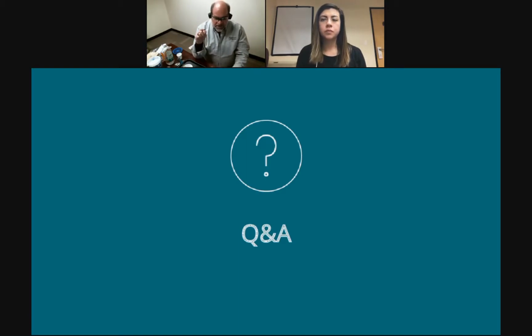We discovered, purely by chance, that if you turn on the accessibility features on your own personal device, where it reads the screen, Graphical Analysis does get read in voice. So you can connect this to a computer or a Chromebook. Or, I don't know about Chromebook because I didn't test it on that, but I tested it on my computer and I tested it on my phone. And sure enough, it'll read the temperatures and the buttons and that sort of thing. So yes, the accessibility features on your device do get echoed in the software. So it's possible. We haven't written any specific activities that I'm aware of for special needs, but at least the software is able to address that.